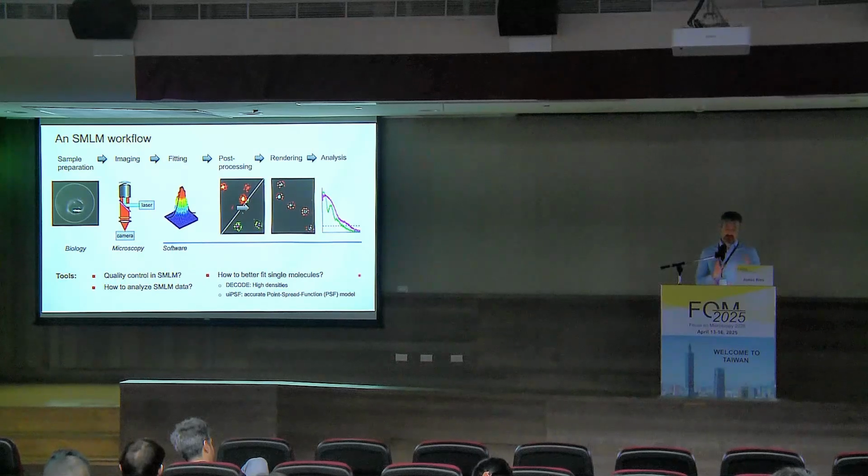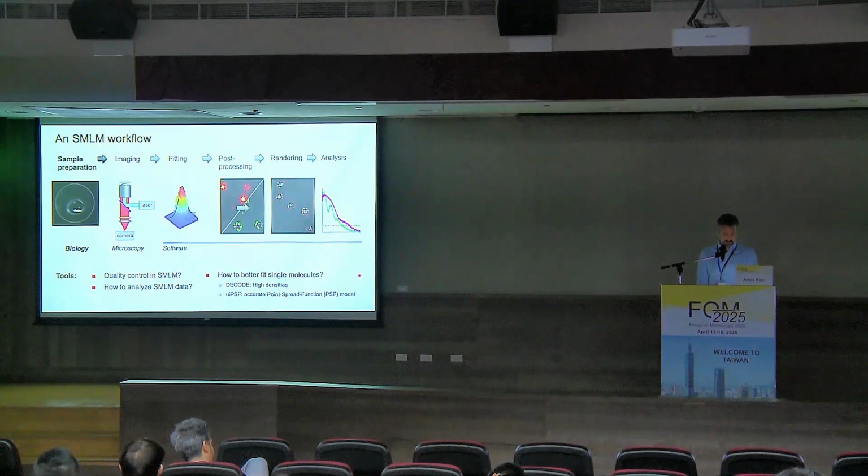So now I will discuss the steps of this workflow step by step and give some of my ideas to this, and then present some tools to maybe improve single molecule localization microscopy. So let's start with the biology.